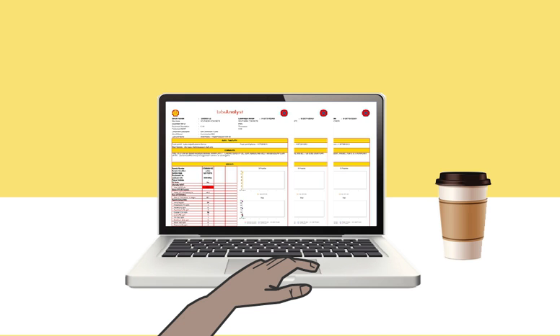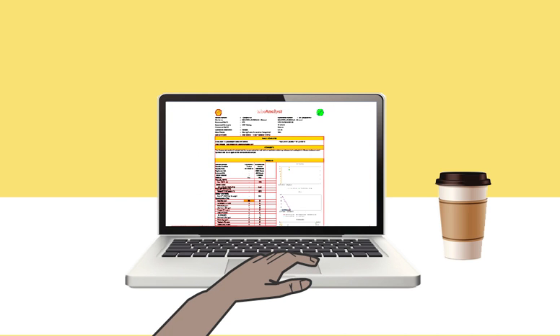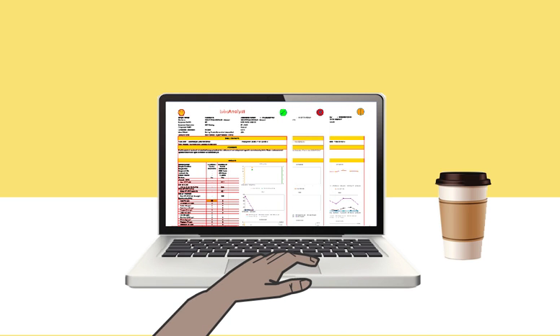An oil condition monitoring program gives equipment owners timely and reliable fluid and machine condition information. Proper reading of a Shell LubeAnalyst sample report lets you track sample trends and monitor, aggregate, and benchmark your results, ultimately to help save you money and improve equipment reliability.